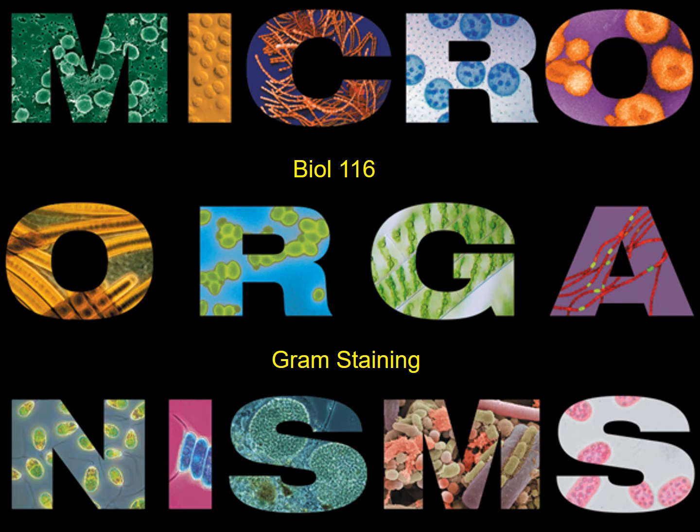Hi, we made it pretty far in microbiology. In this presentation, we'll describe the gram staining process to distinguish between gram-positive and gram-negative cells.